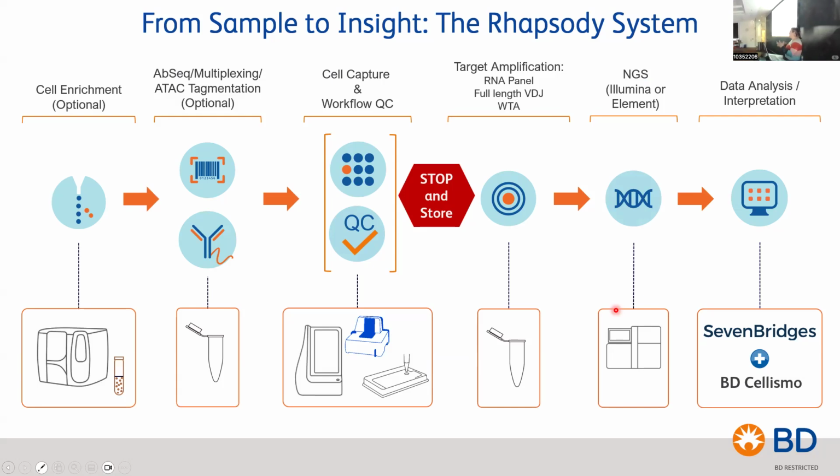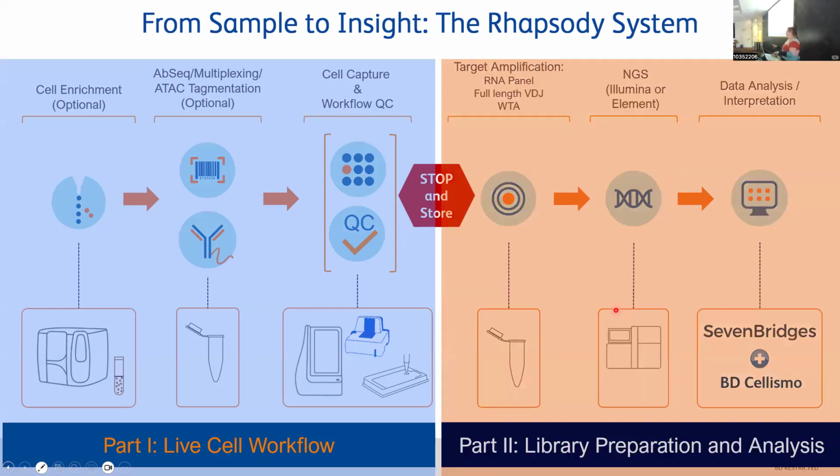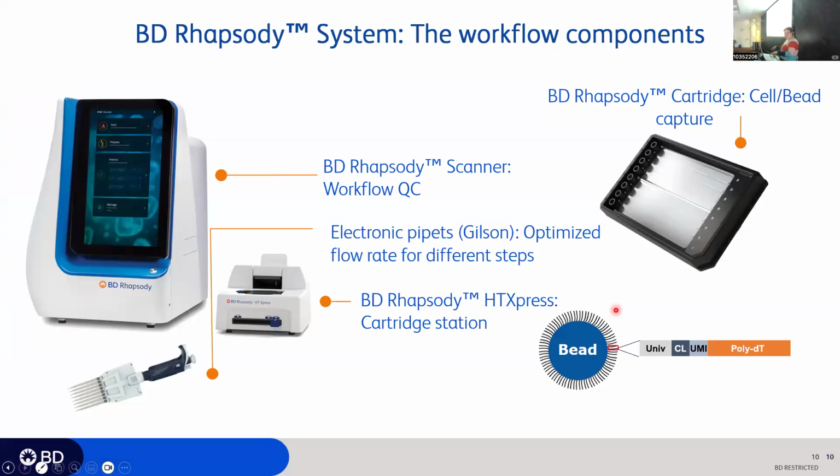It allows you to do some data exploration while you wait for a bioinformatician to really dig into it.